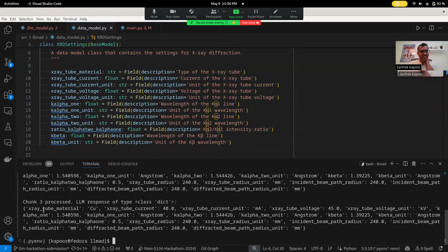So we think this kind of an approach using LLMs towards automated parsing is a pretty good thing, and we definitely want to take a deeper look into this.